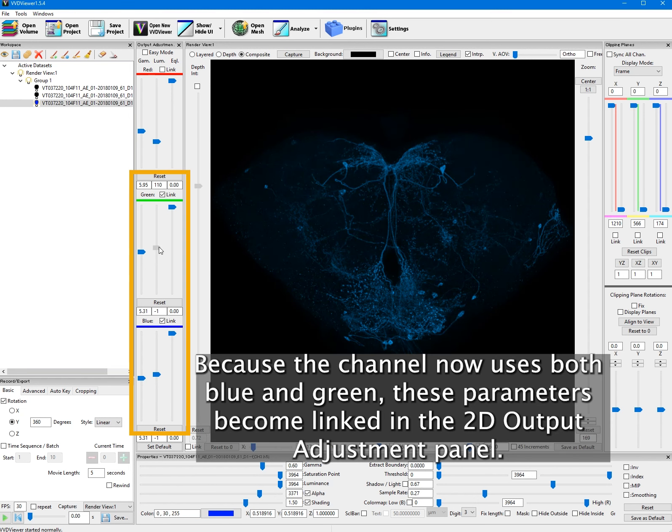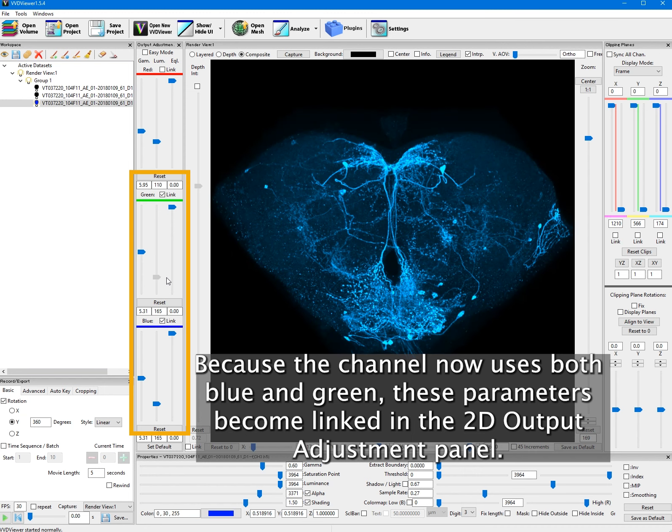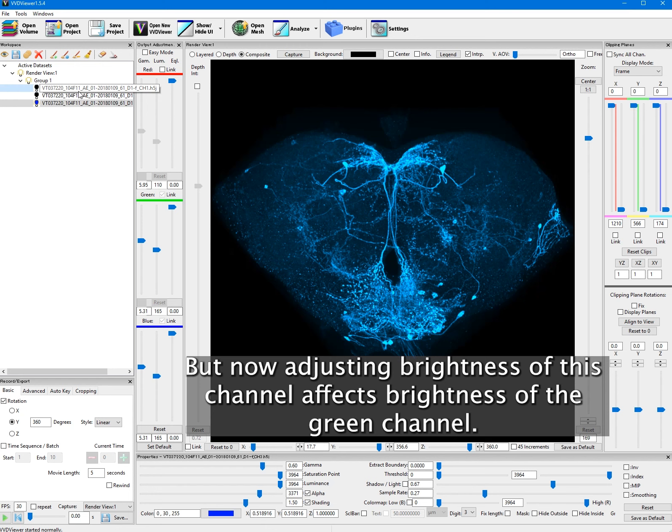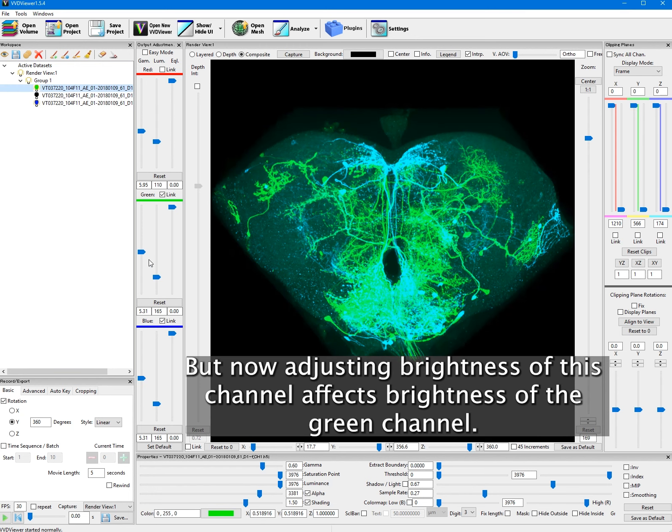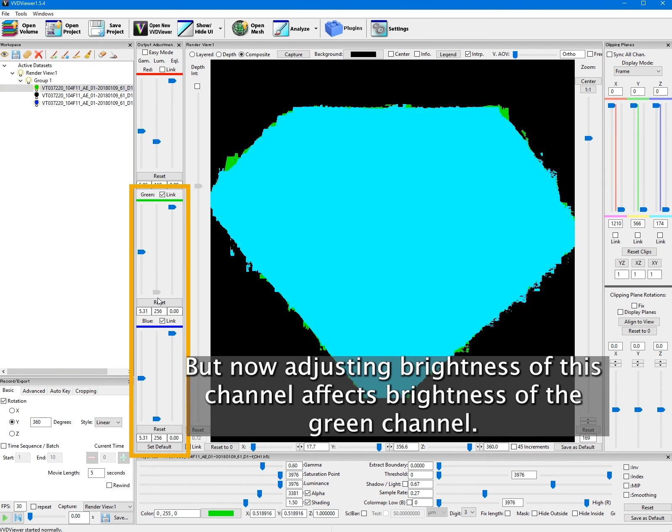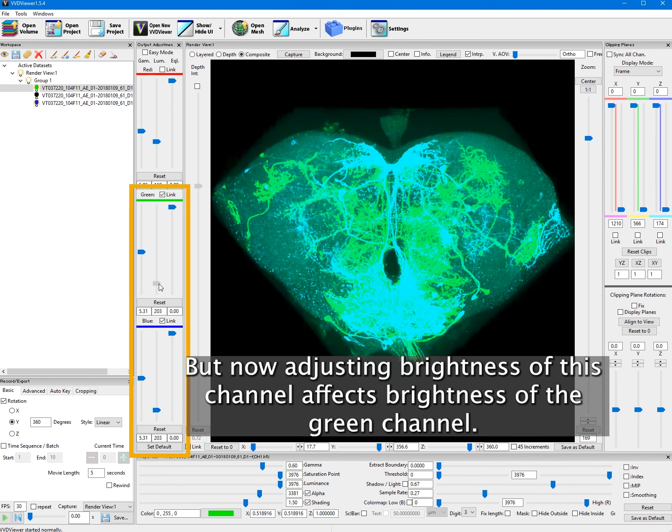Because the channel now uses both blue and green, these parameters become linked in the 2D output adjustment panel. But now adjusting brightness of this channel affects brightness of the green channel.